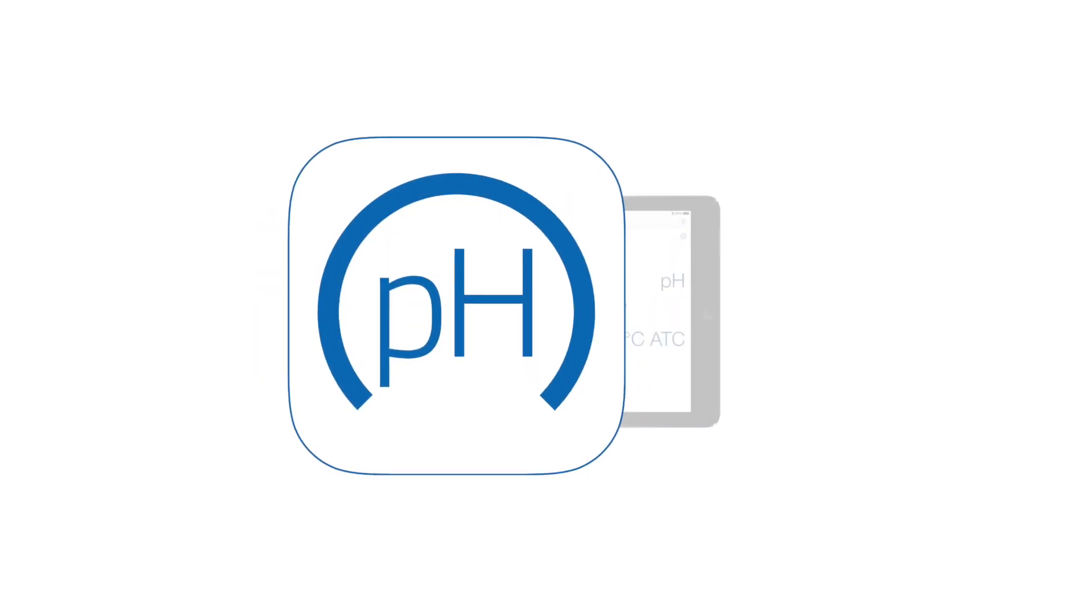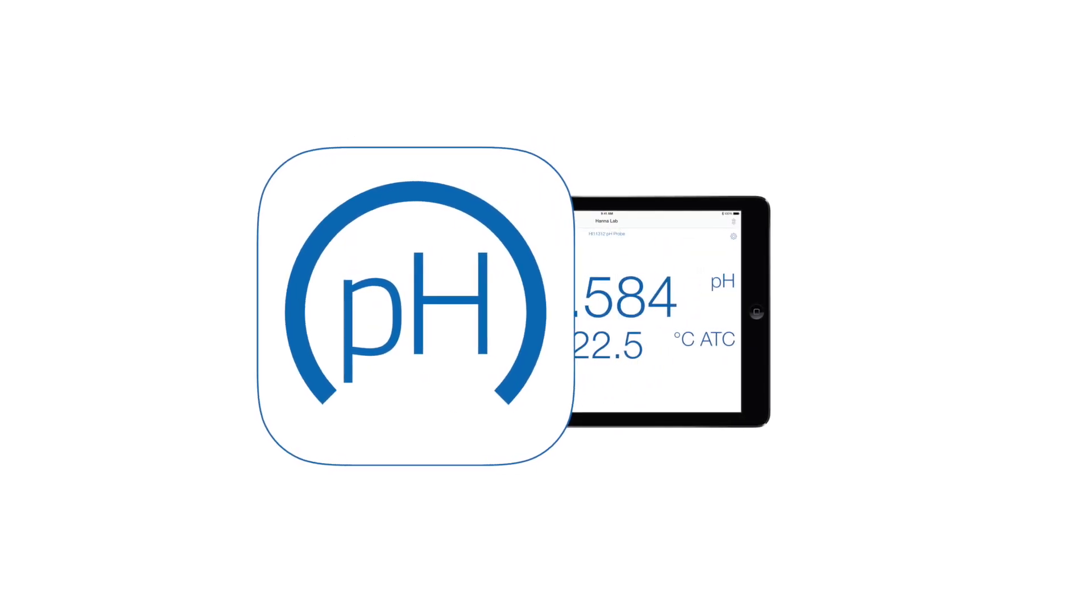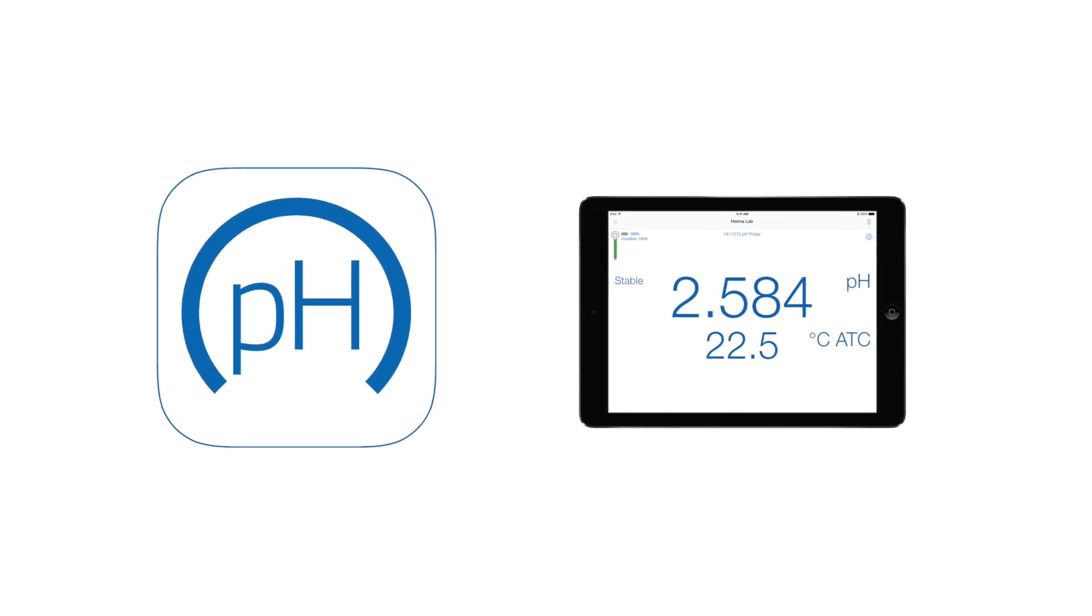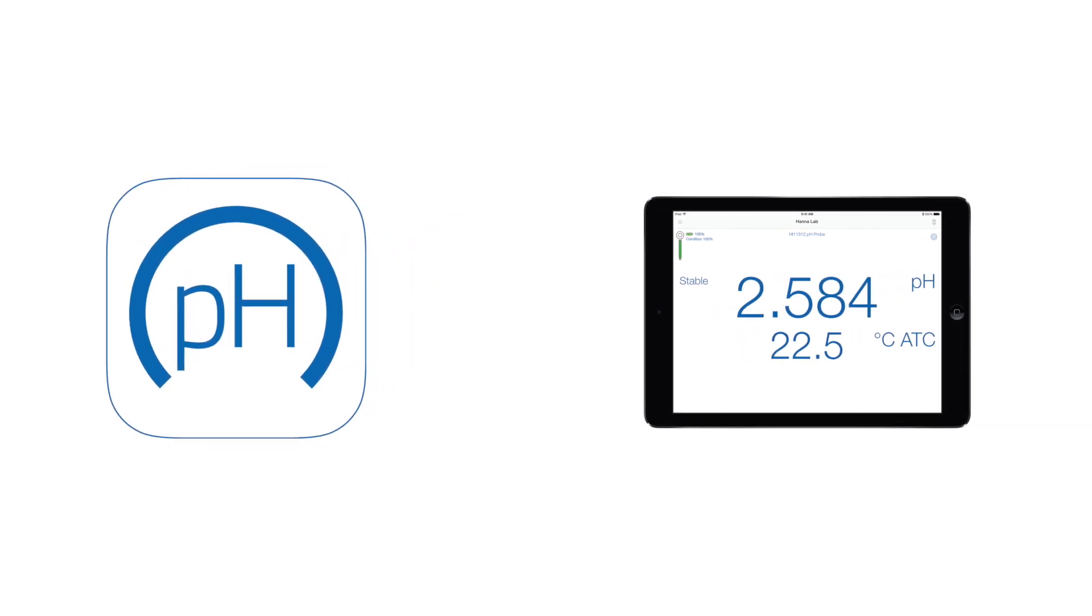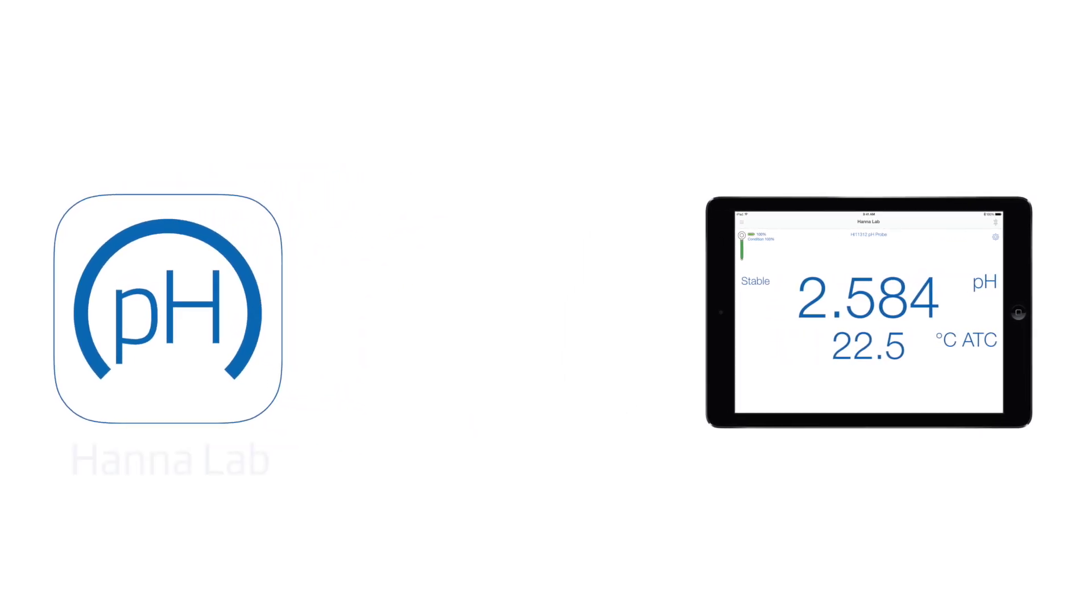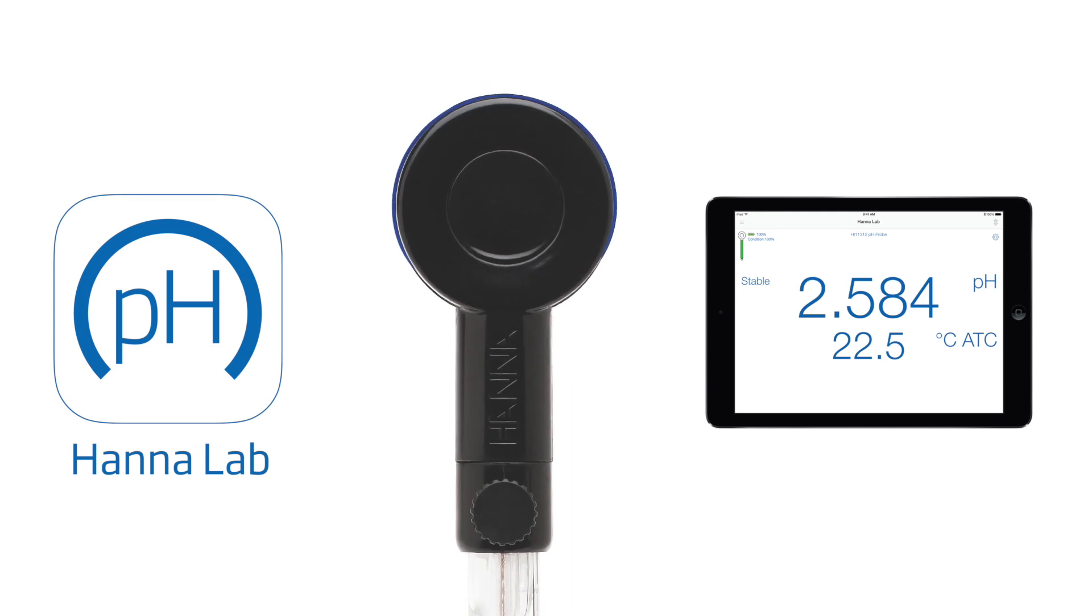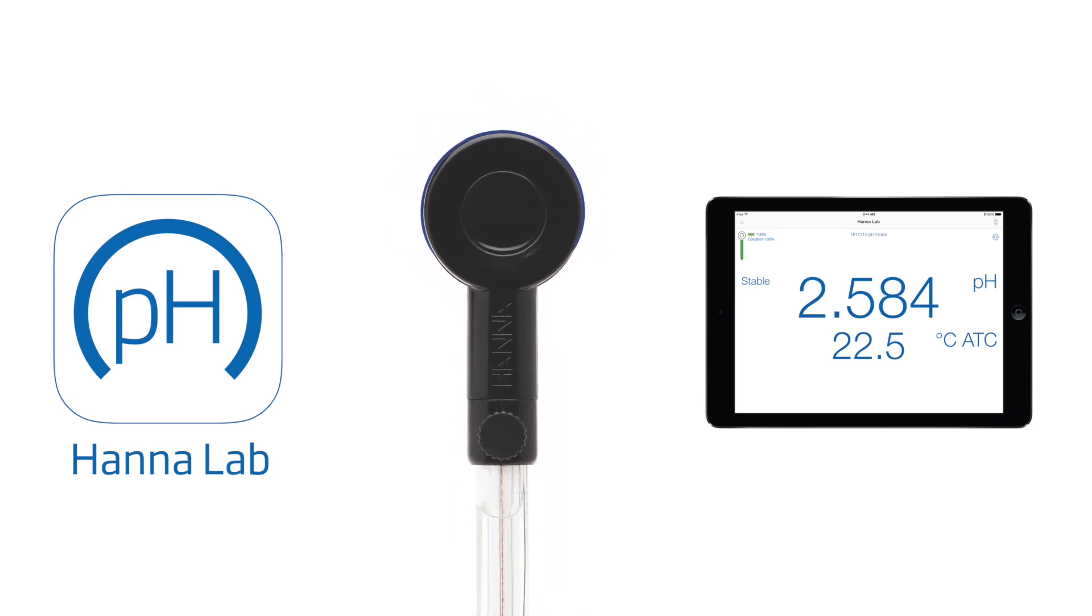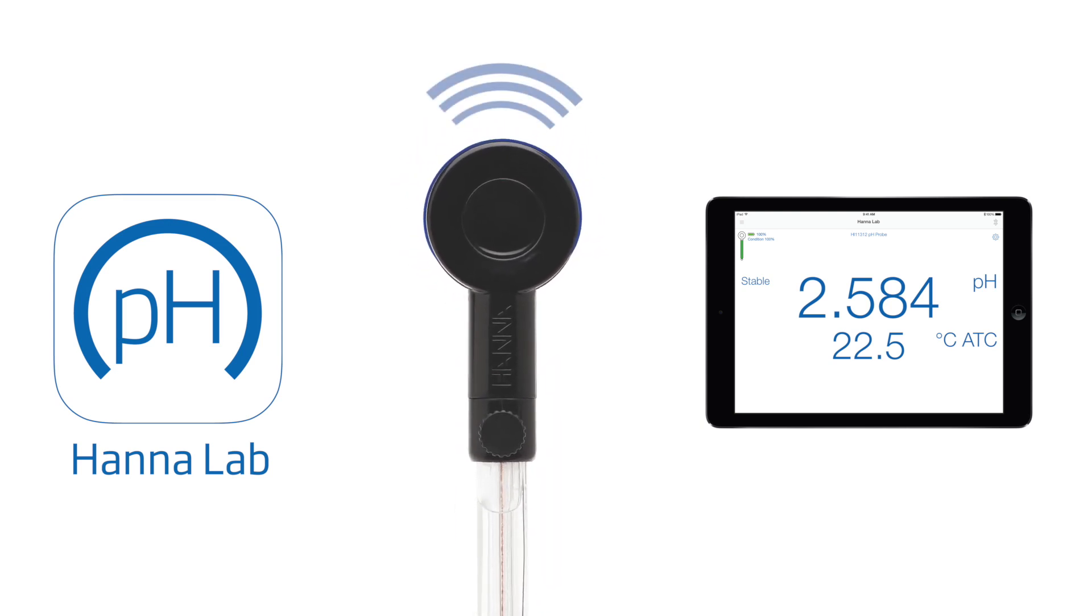The HANA Lab App is a unique application that turns an iPad with Bluetooth smart technology into a fully functional pH meter. When used with the HANA HALO brand of pH electrode products, the Lab App is an ideal and versatile tool for educational or laboratory applications.